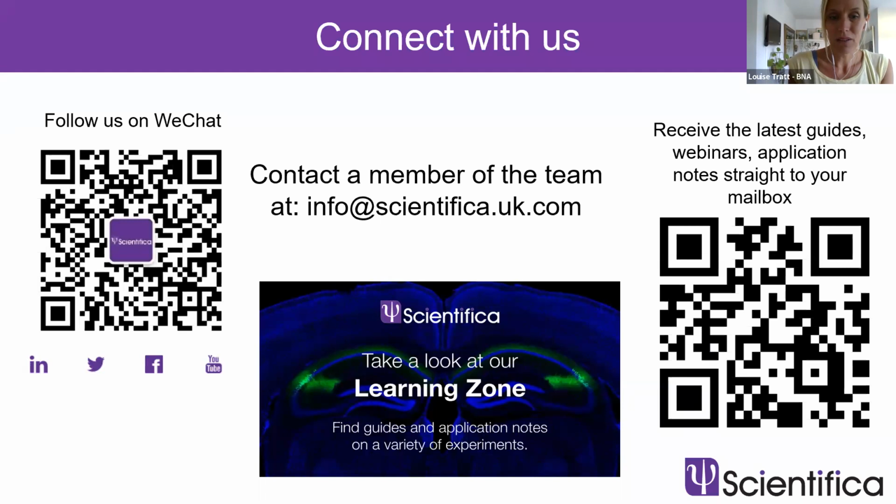Great. Okay. Well, we don't have any questions at the moment. You know, it's quite early here in the UK, so maybe people are still... Oh, here we go. We have a question now. So this is from Jazina. Says, thanks for the presentation. I may have missed this during your talk. What would be a typical frame rate for galvo scanning?